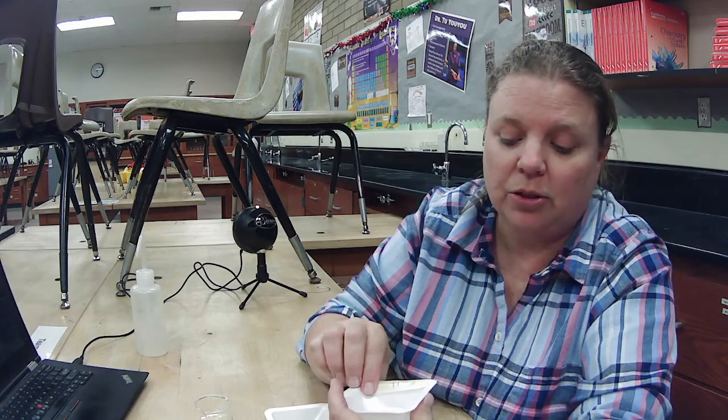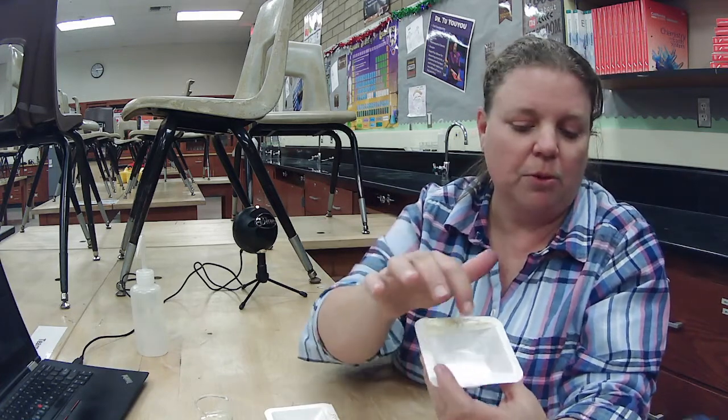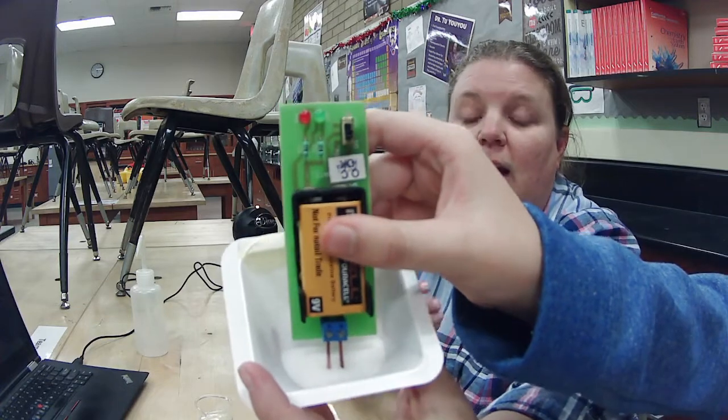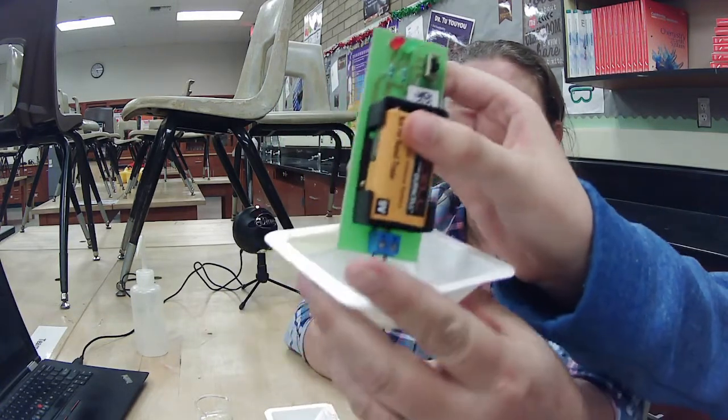How about salt? Are you ready to test the salt, Josie? Let's take both prongs, and make sure both prongs are in the salt. This is just solid salt. Again, we have no conductivity as a solid, even with an ionic bond, known as salt.